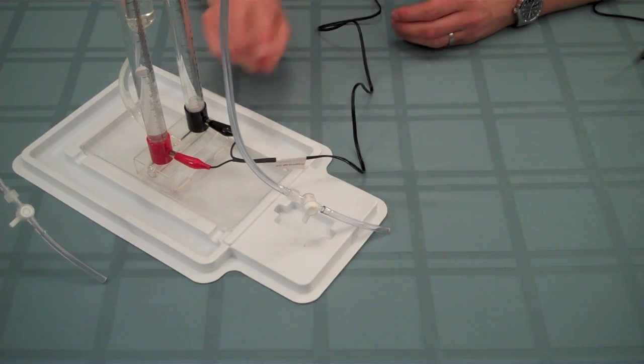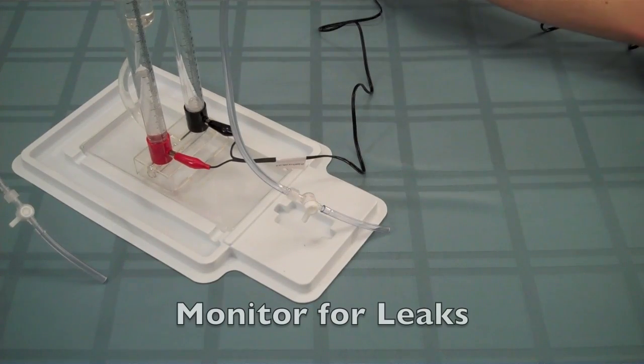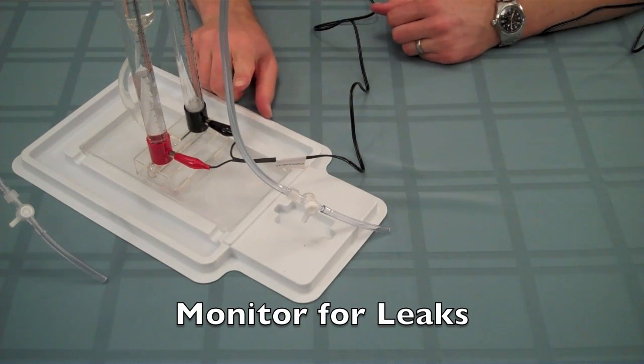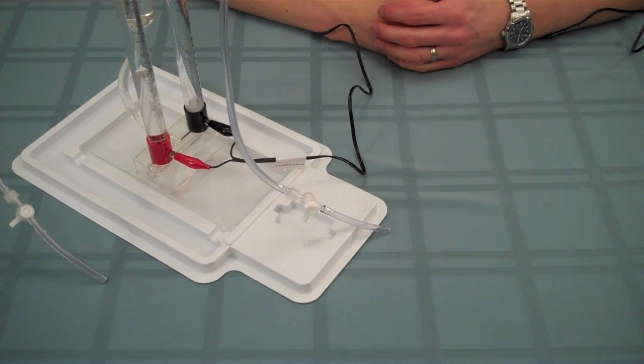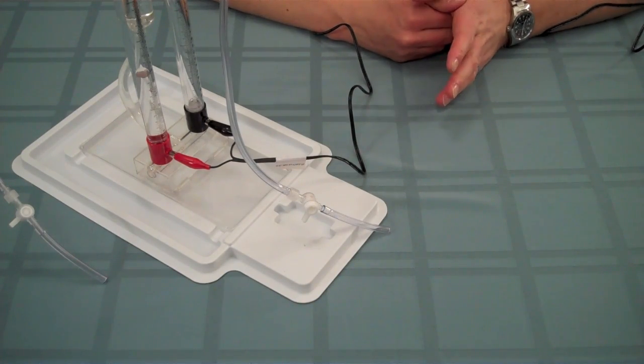When the hydrogen storage column is nearly full, go ahead and unplug the power supply and monitor the level of gases in the storage columns for about one minute. If the level of gas decreases, then there is a leak in the electrolyzer somewhere.